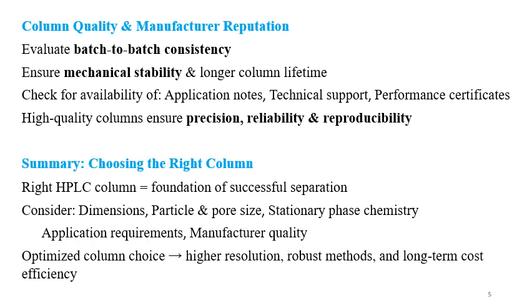Summary: selection of the right column. The right HPLC column is the foundation of successful separation. Consider dimensions, particle size and pore size, stationary phase chemistry, application requirements and manufacturer quality. Optimize column choice for higher resolution, a robust method, long-term use and cost efficiency.